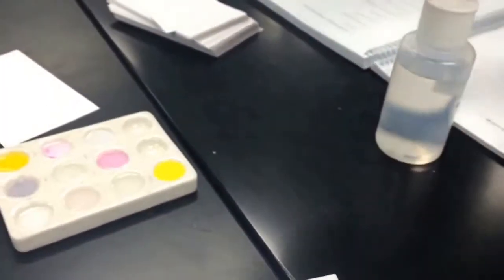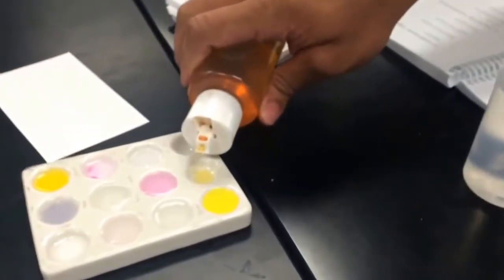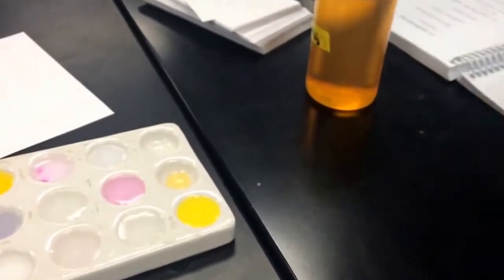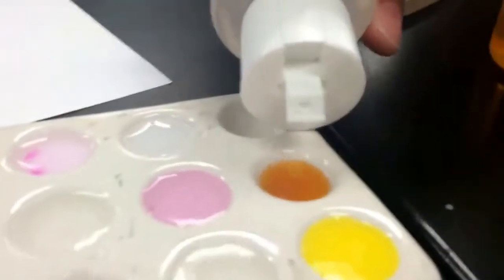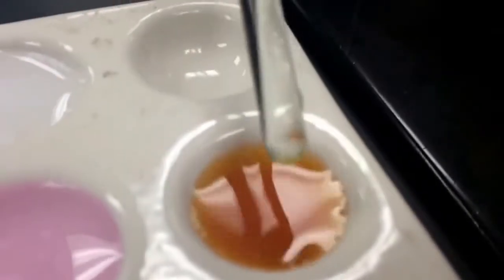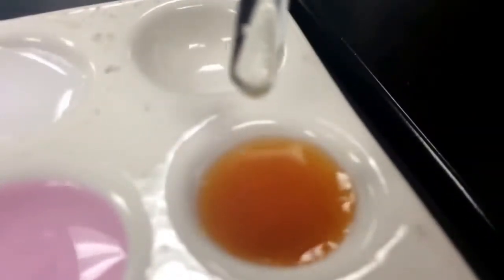Number 13 is iron nitrate and sodium hydroxide. We are going to put the iron nitrate first. Here's the iron nitrate. And it looks like fire, doesn't it? And there's sodium hydroxide. That doesn't look like fire. It looks like something else. And we do have some precipitate, some dark orange precipitate, very small dots. Can't really see them on camera, but very small.